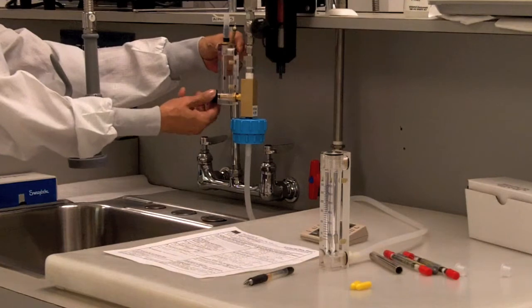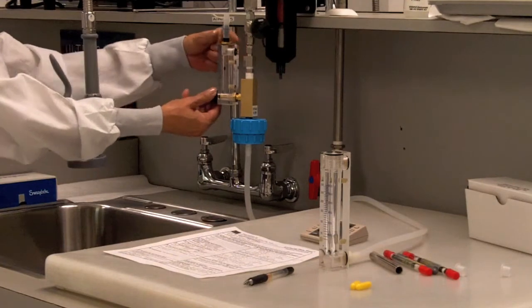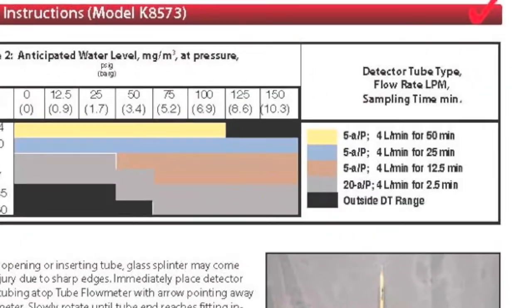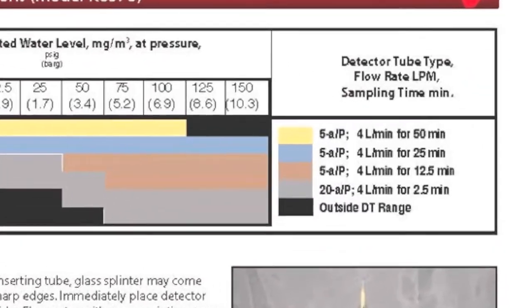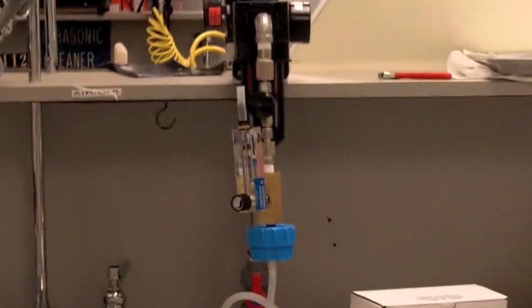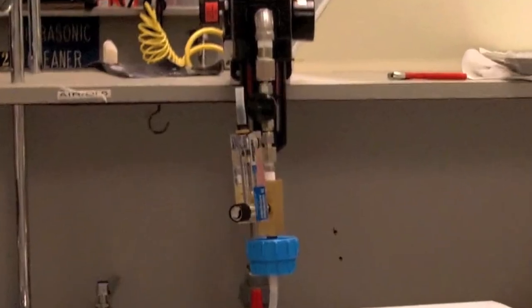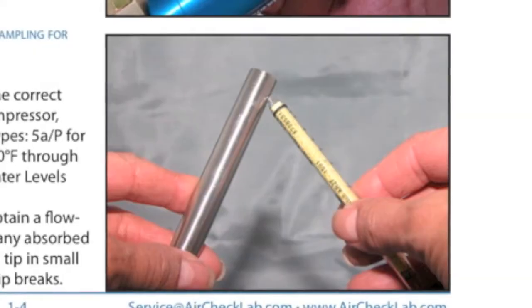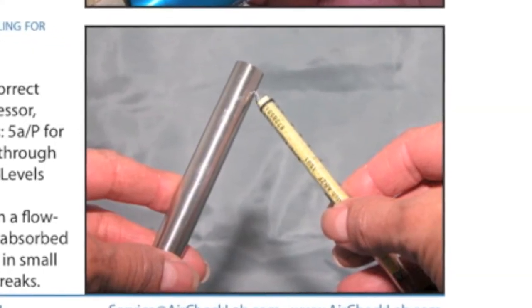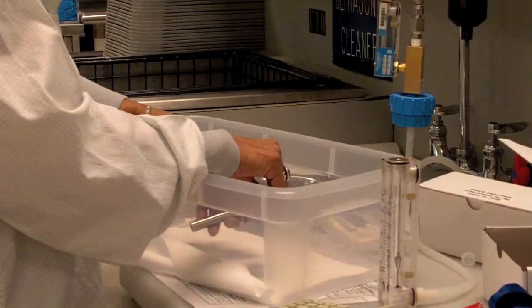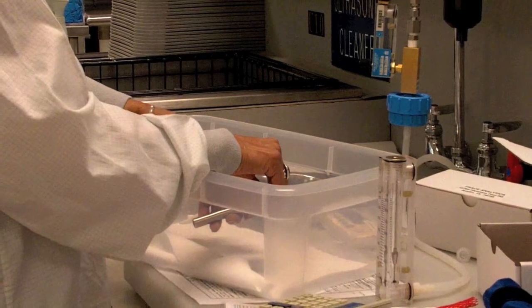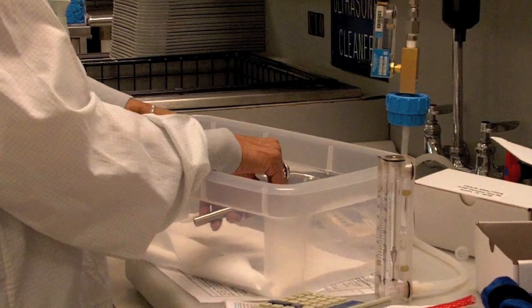Turn the tube flow meter needle valve counterclockwise and adjust for a reading of 4 liters per minute. Allow air to flow for 2 minutes before inserting the detector tube. Be prepared to break the tips of the detector tube in a safe manner, such as over a trash can, to catch the broken glass tips.